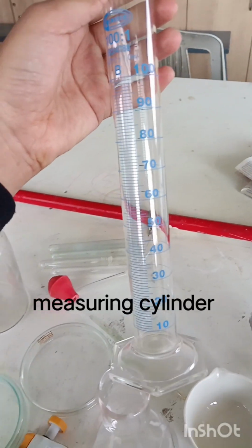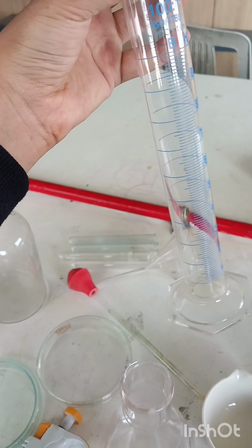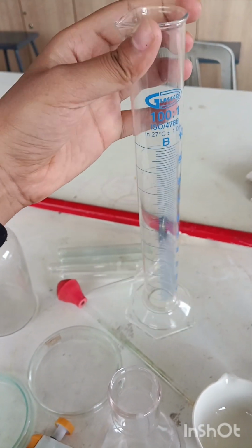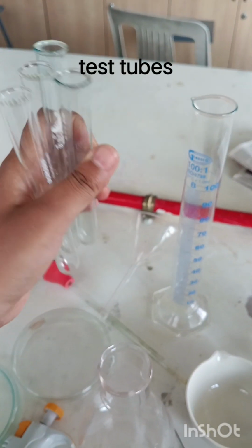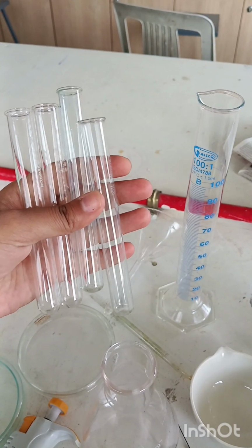This is a measuring cylinder, used to measure the volume of liquids accurately. These are test tubes, small glass containers used for mixing, heating or storing small quantities of substances.